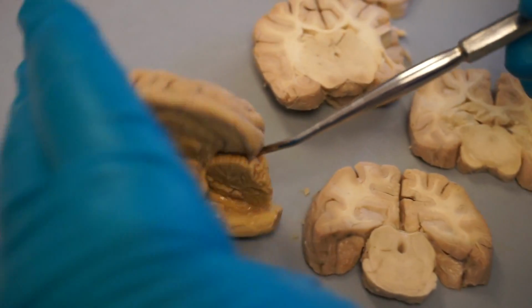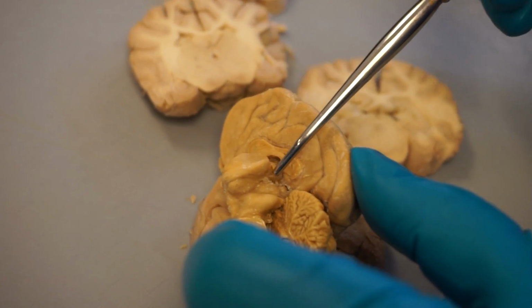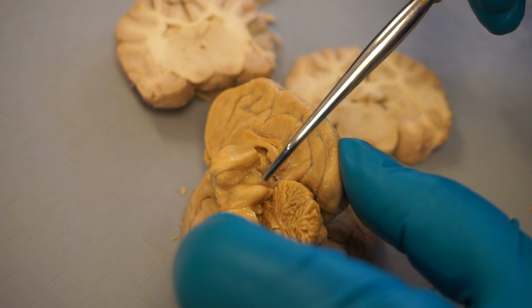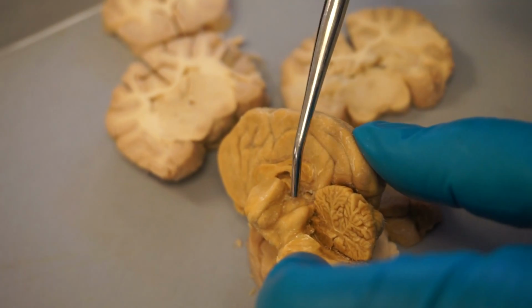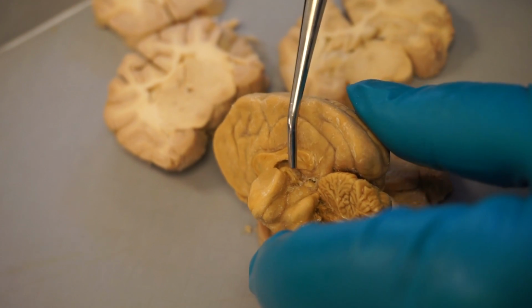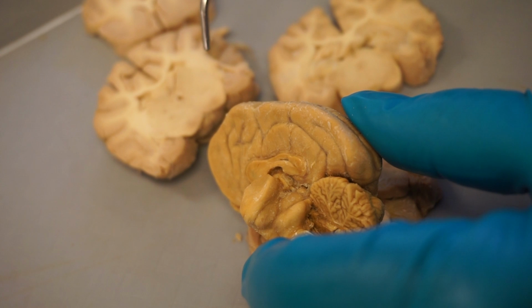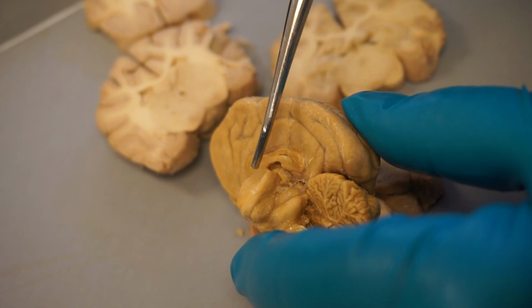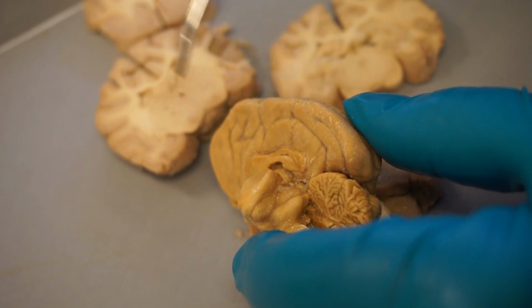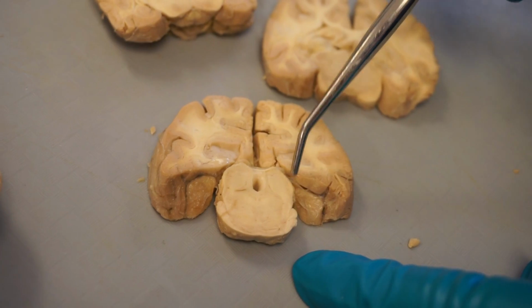If you recall, on this hemisection of a brain, we have rostral colliculi and caudal colliculi that are involved with reflexes, so visual and hearing reflexes. So it's always eyes before ears, conscious and reflexes. So that would be the caudal colliculi.